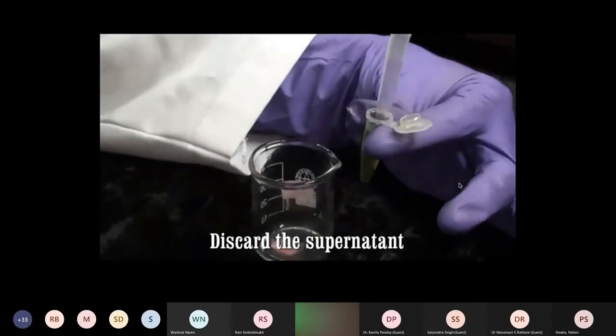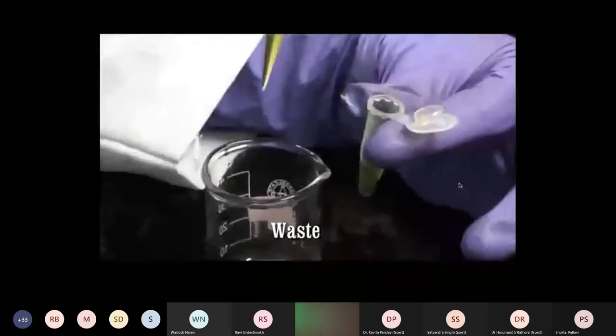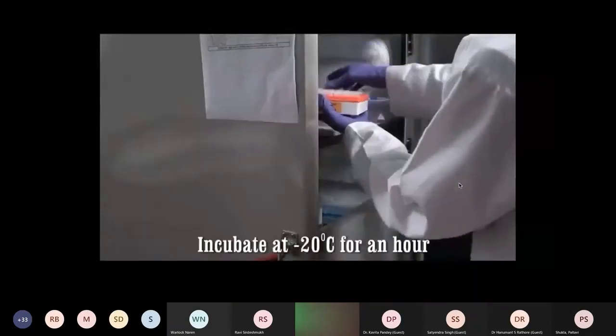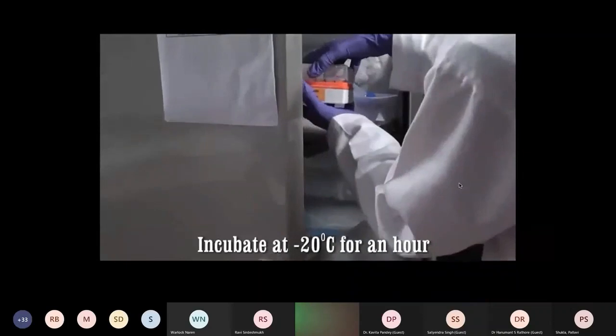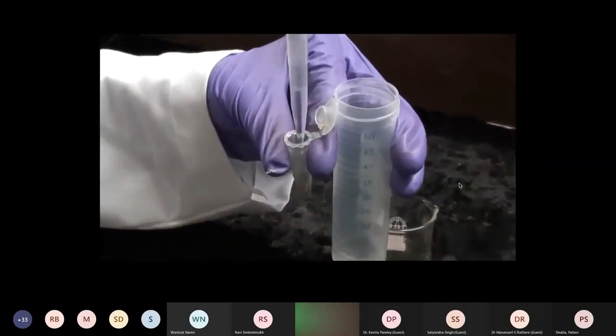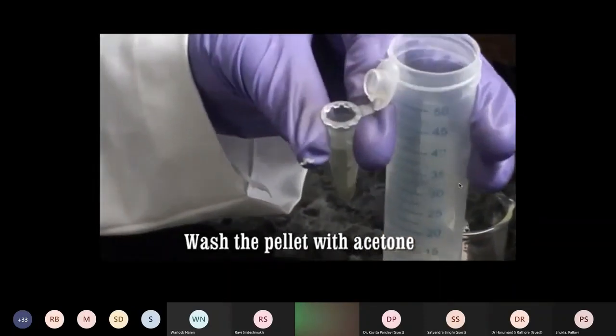Discard the supernatant and retain the pellet containing plant proteins along with various other intracellular components. Incubate the pellet at -20 degrees Celsius for an hour. Protein precipitation. Remove the pellet from -20 degrees Celsius and add chilled acetone to it.